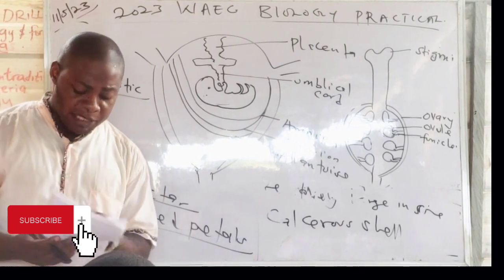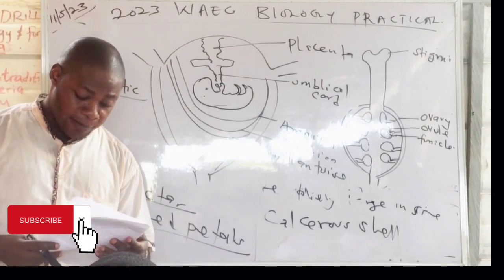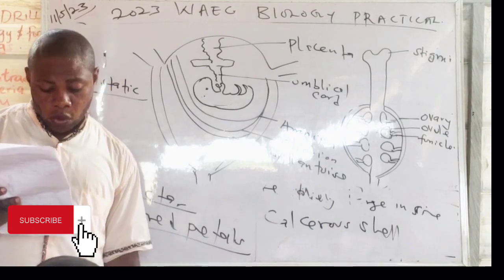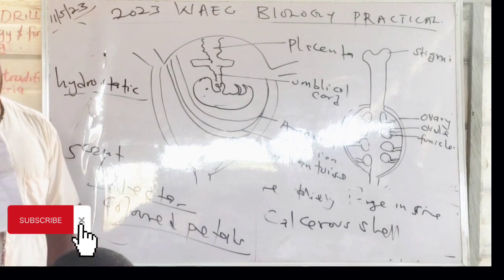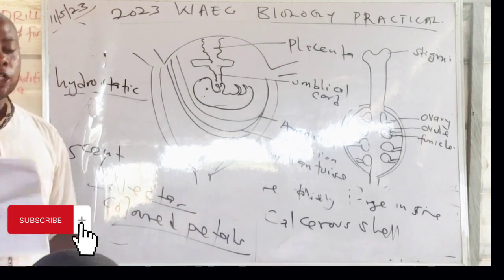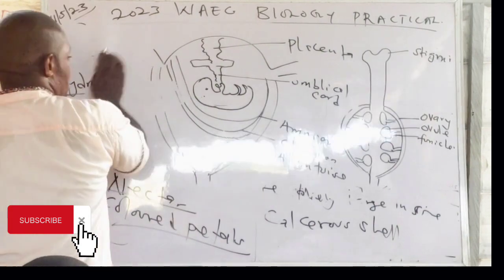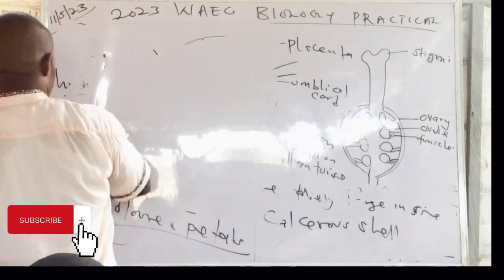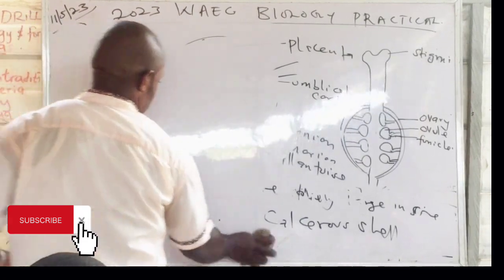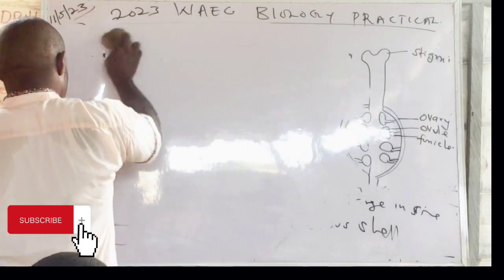Let us go to the next specimen. It is E. So what is E? Leaf, yes, leaf or part of a leaf. So let us group specimen E and F together. F is what now? F is guinea grass. Yes, F is guinea grass.